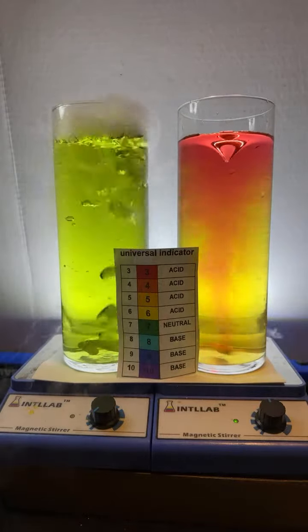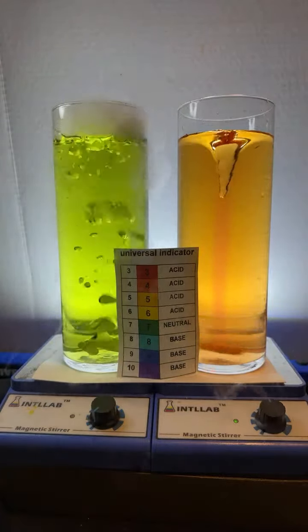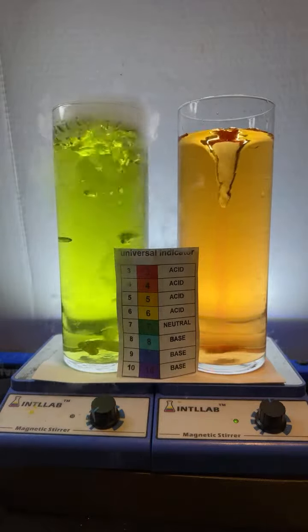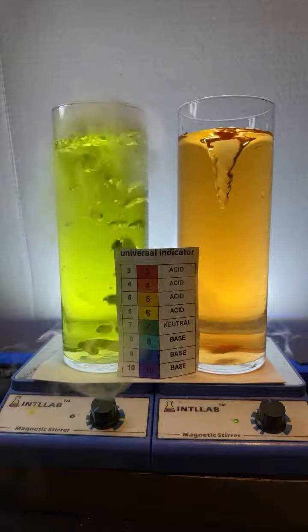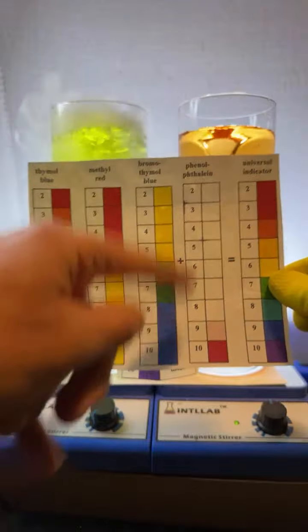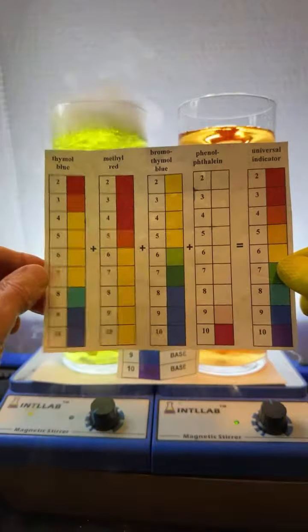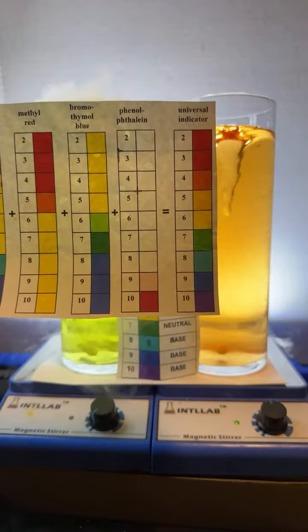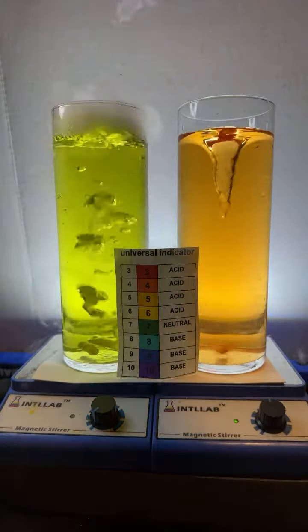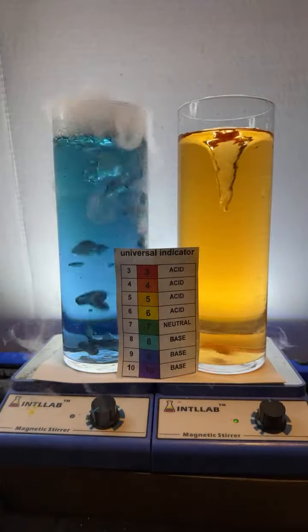What is universal indicator? It is a mixture of 4 chemicals. Those chemicals are thymol blue, bromothymol blue, methyl red, and phenolphthalein. Here, this is what it's made of. Each different indicator dye shows different colors at different pH values. And when you add all 4 of them up, you get the colors of the rainbow at the different pH values. That's the basic idea of how universal indicator works. Let's add a little bit more base over here on the left and let that carbon dioxide neutralize it again.